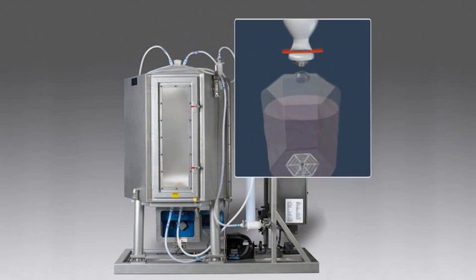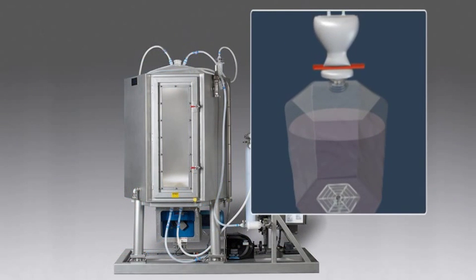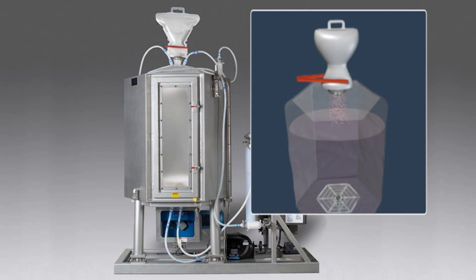Powder bags are available in 1, 5, or 25-kilogram sizes coupled to the top of the mixing bag to allow dust-free transfer of powders.